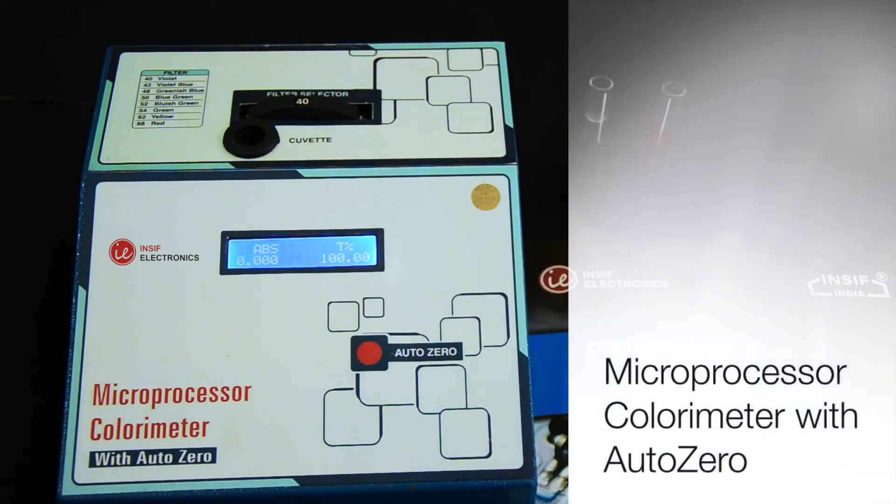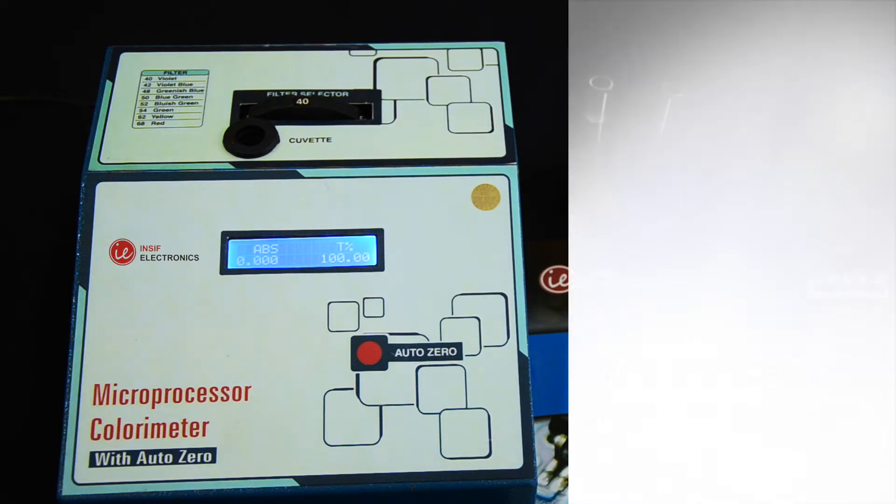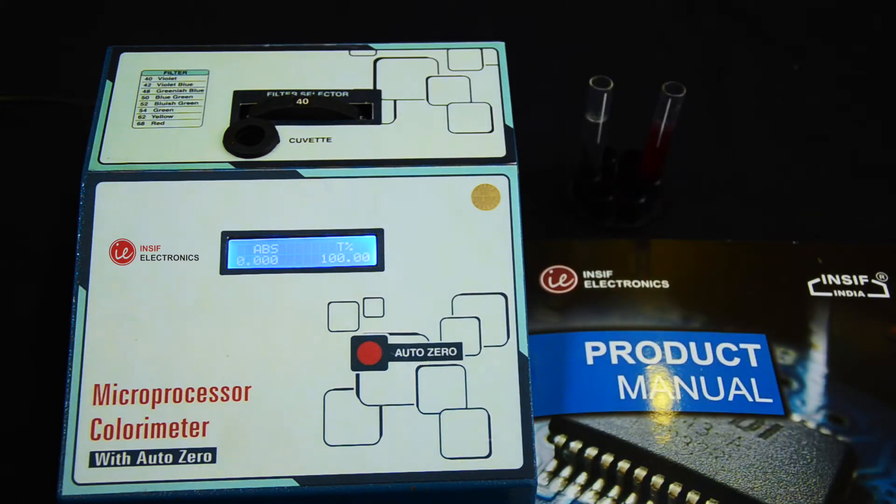We are going to see how to use a colorimeter with AutoZero. The colorimeter with AutoZero is a compact and easy to operate instrument for colorimetric analysis of solutions.